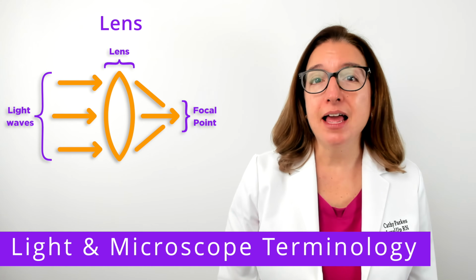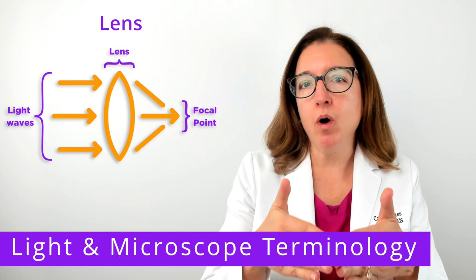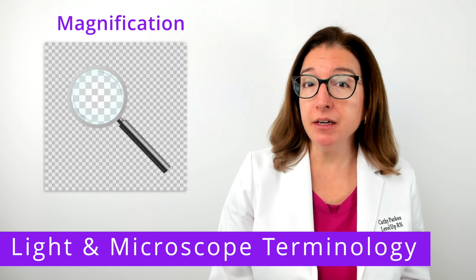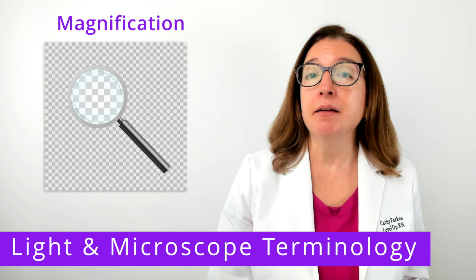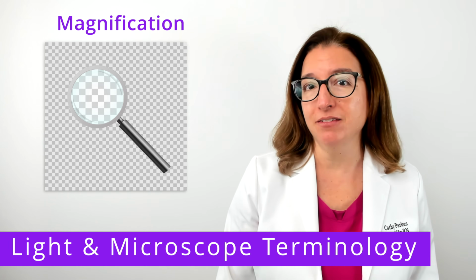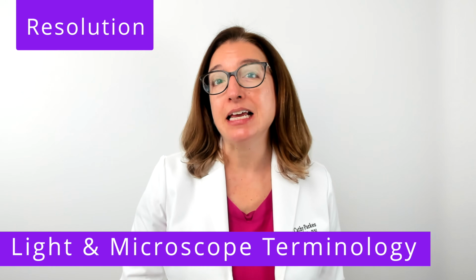Next, let's talk about a lens, which is a curved surface that collects all the light that hits it and focuses it at one point, called a focal point, to produce an image. Magnification is the ability of the lens to enlarge an image. So a lens with a magnification of 10x will create an image that is 10 times larger than in real life. Resolution is the ability to distinguish two separate points or objects in an image.